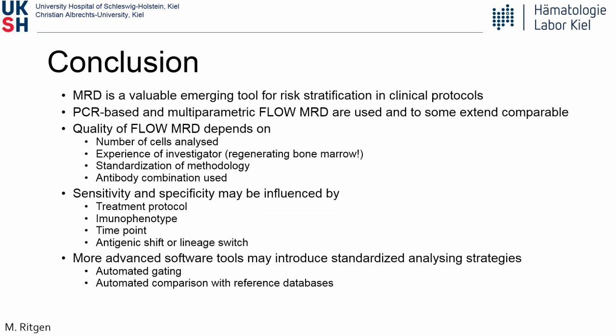Yeah, thank you very much. Well, the main problem probably is the amount of cells to be analyzed. Compared to regular flow for immunophenotyping, like immunodeficiencies or so on, you have to acquire a bunch of cells, 5 million or even more per tube. So this takes time, and your machines are more occupied than you are used to. And you need more or less bulk-lysing procedures to get so many cells into your tube. This is the first point, and if you're not used to these techniques, you have to establish this as well together with the protocol.